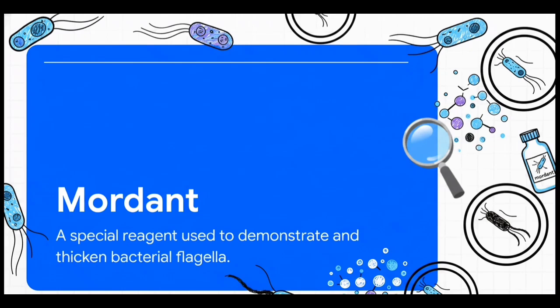Take flagella, those microscopic tails bacteria use to swim. To see those, we have to use a chemical called a mordant. The mordant essentially coats and bulks up those incredibly fine flagella, thickening them just enough so that when we apply our stain, our microscopes can finally catch a glimpse.